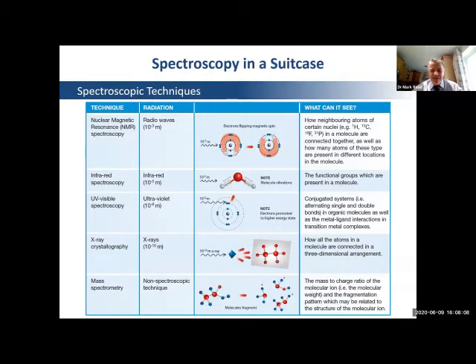So we had a quick look at the electromagnetic spectrum. We looked at where infrared was. But chemists actually use quite a bit of that spectrum for different techniques, because it's very rare in chemistry that one technique will give you all the answers. In fact, usually we rely on several. And in this workshop, we're going to look at infrared and also mass spec and putting the two bits of information together to work out an unidentified compound.